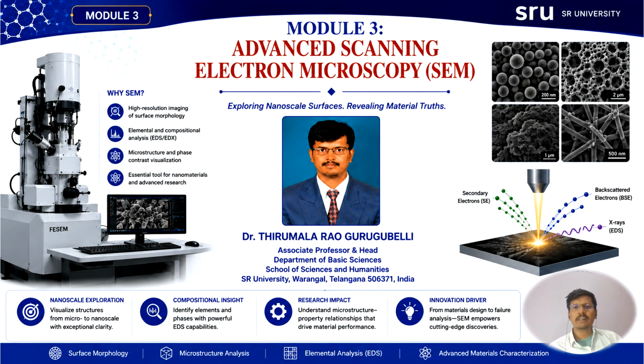In modern nanotechnology research, SEM has become an important tool because it bridges the gap between materials synthesis and materials performance. The materials performance depends highly on the morphology and size of the material, and the size and morphology can be controlled during synthesis.